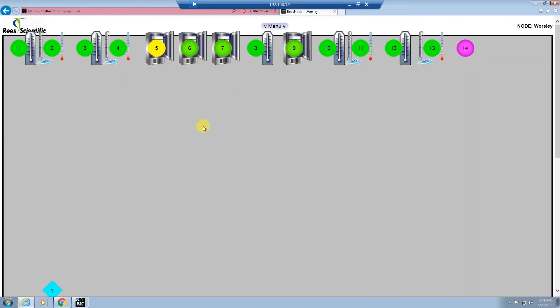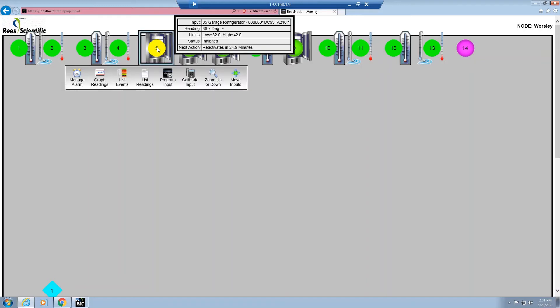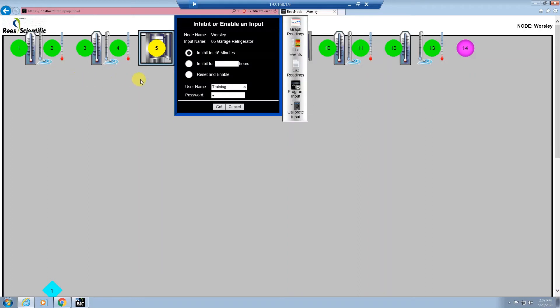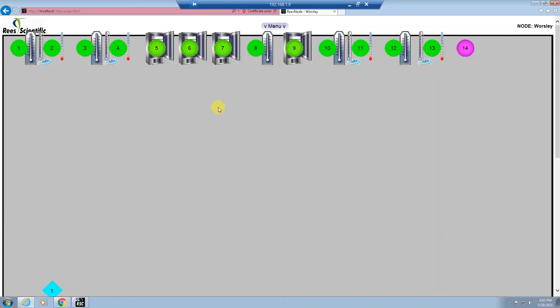To reset an input that is inhibited, you can left-click on it and select manage alarm. Select reset and enable, put in your username and password, and hit go. If the input is within its operating range of the lower and upper limit, it will turn back into a green or normal status.